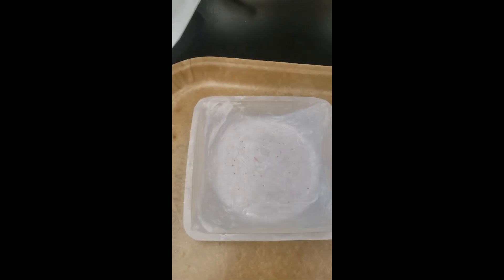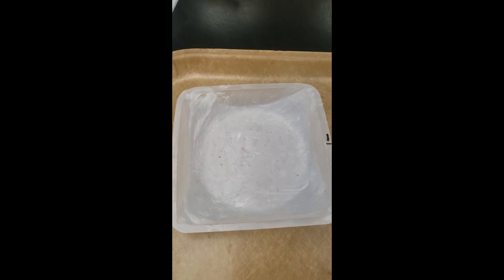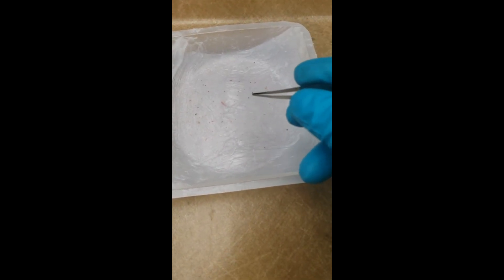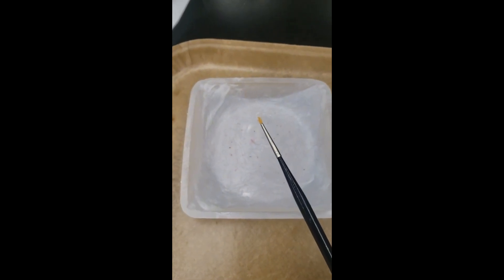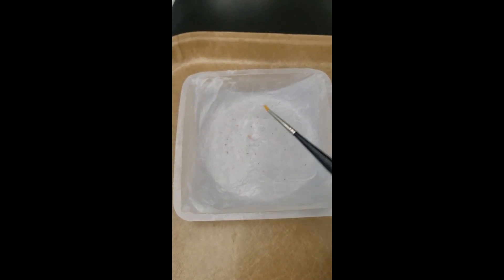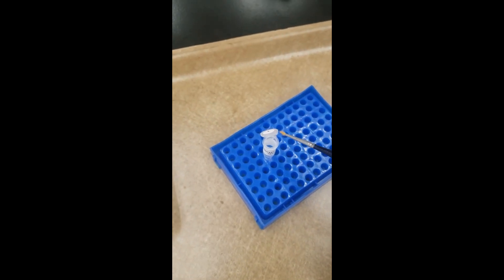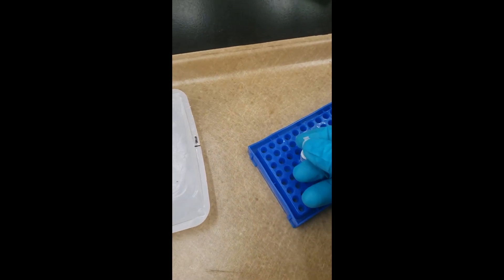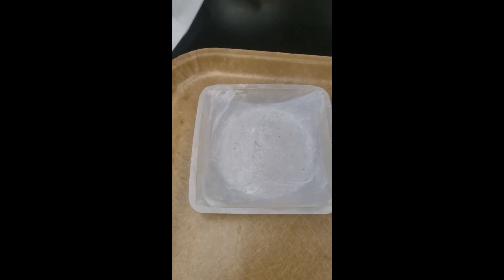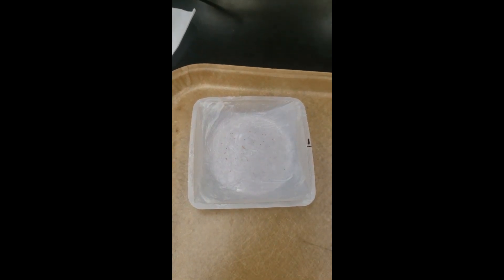The tube will have some solution in it to preserve the DNA. Open the top and then using forceps, pick the individual Varroa off into the tube. Or you could use a fine-haired brush to get them out of the Vaseline and into the white-top tube. Once you've collected all the Varroa off the tray, record the number on the datasheet under the column that says 'Varroa from the drop.'